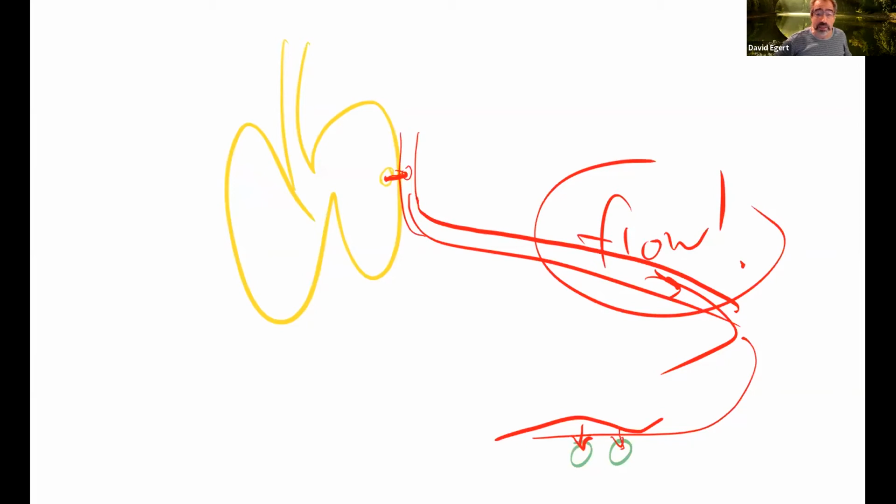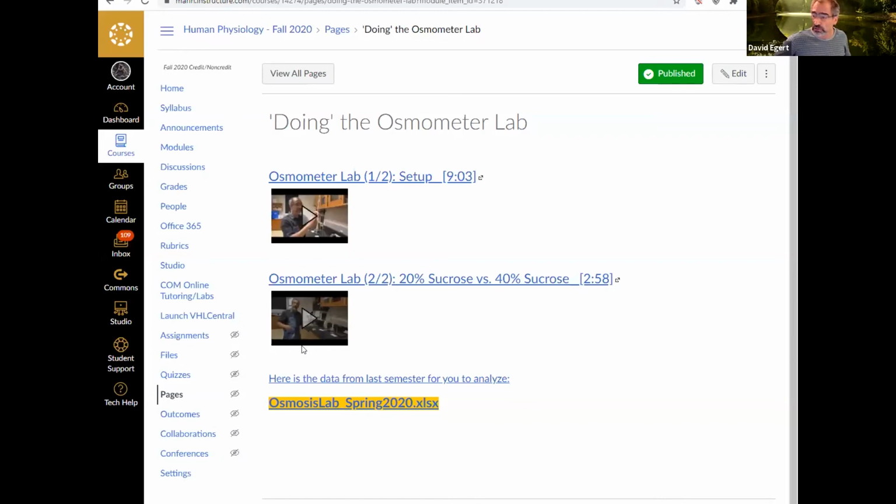So that's important. That's something you're going to see in this thing I am about to share with you now, which is Tina showing the behavior of the two dyes in the agar. So we're going to go back to the module.